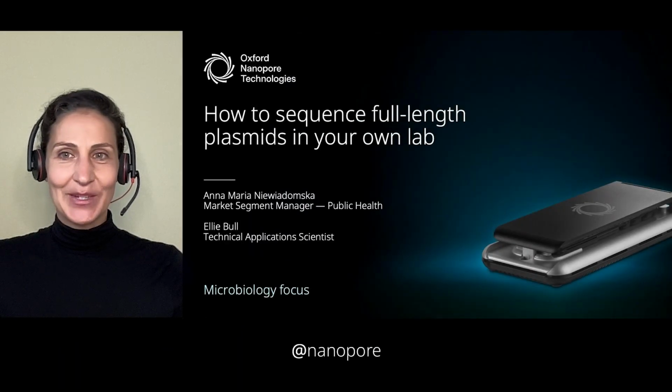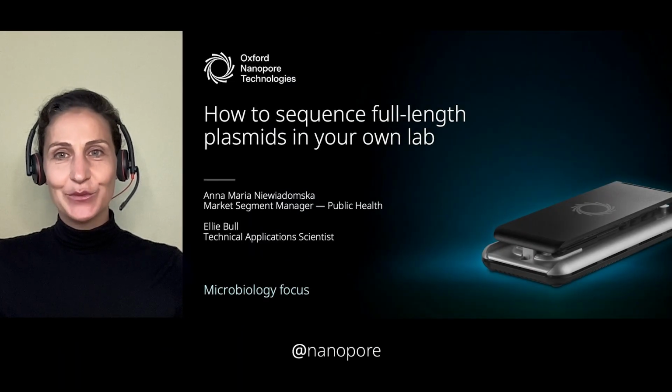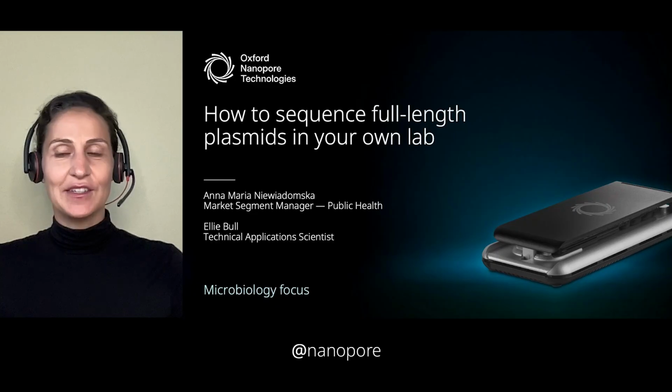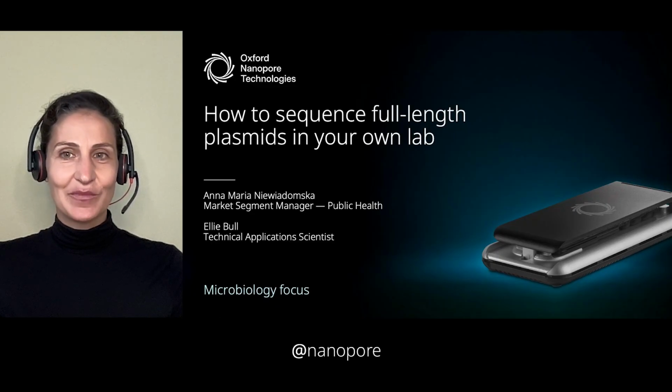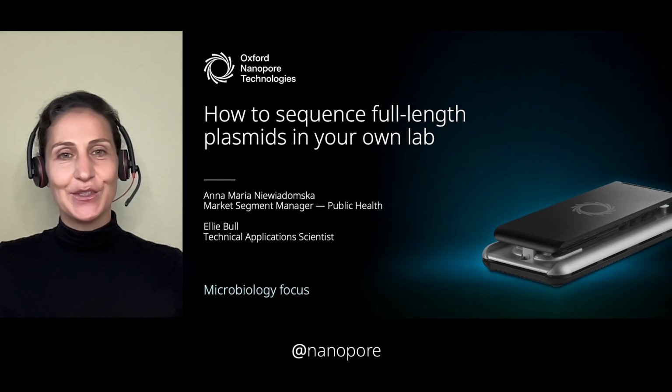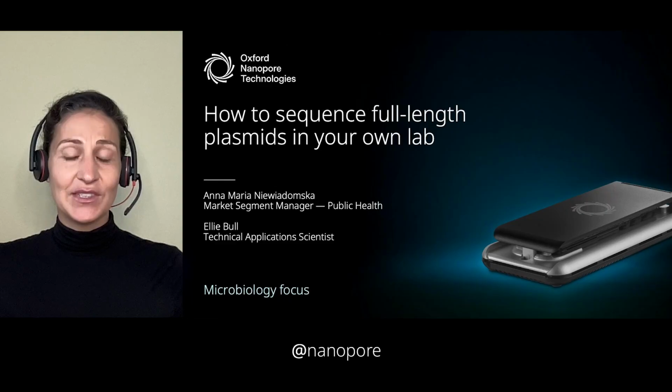Hello and welcome to this masterclass series on how to sequence full-length plasmids in your own lab. My name is Anna Maria Niewiadomska, and I'm the Market Segment Manager for Public Health and Infectious Disease Microbiology at Oxford Nanopore Technologies. In the first part of this masterclass, I'll introduce you to a new way to sequence your entire plasmid before my colleague Ellie takes you through the technical process of full-length plasmid sequencing.